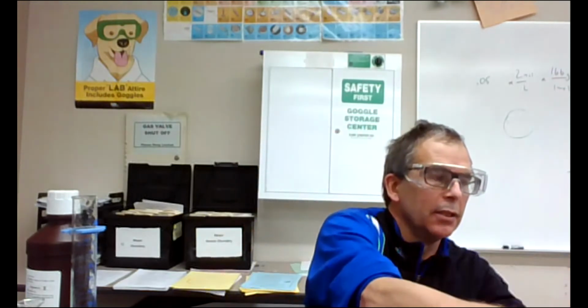This is getting really, really hot. And the bottle is actually shrinking, getting much smaller. Ouch. Okay. So it's really hot and that bottle is shrinking. You can see the ring around the cap is becoming less. So that's one reaction.